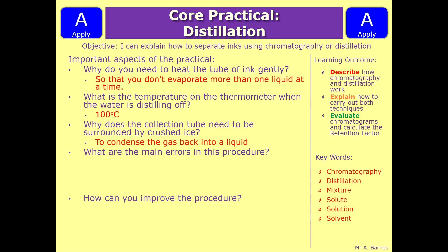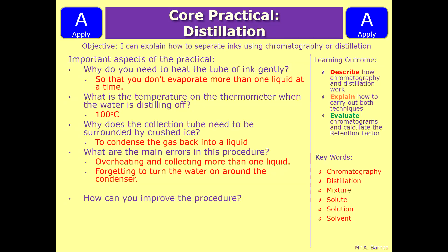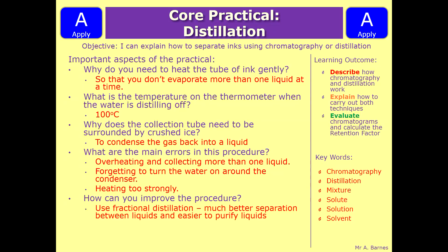What are the main errors in this procedure? The main one is overheating and collecting more than one liquid, so you might evaporate it and get two liquids coming off. Another is forgetting to turn the water on around the condenser, so you're not collecting the evaporated liquid quickly enough. Heating it too strongly can also break the glass and lead to more than one solution being collected. How can you improve the procedure? Simple distillation separates a couple of liquids, but if you've got more than that, go with fractional distillation, which gives much better separation and is easier to purify the liquids.